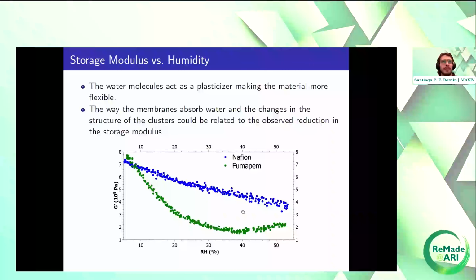So we are developing the connection between these two graphs. In the mechanical part, the water molecules act as a plasticizer, making the material more flexible. On the other hand, we are not pretty sure about this trend, so we are doing extra experiments to be sure that that is a real mechanical behavior of our sample.